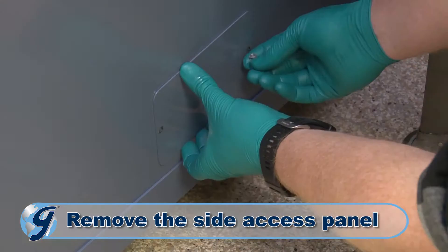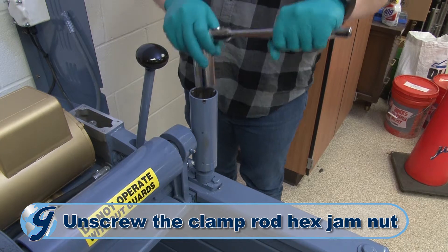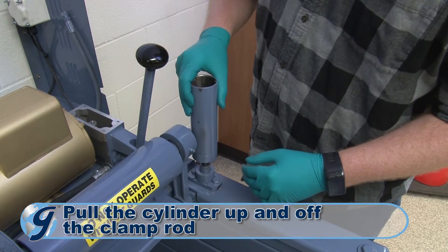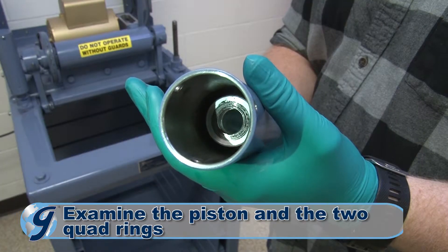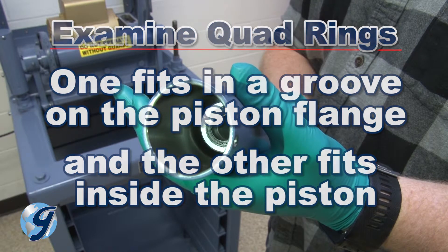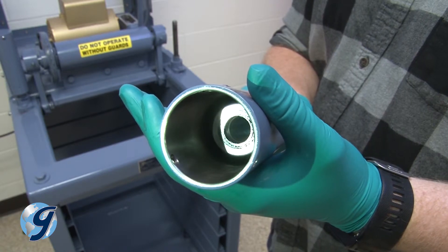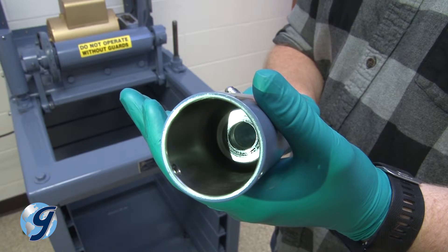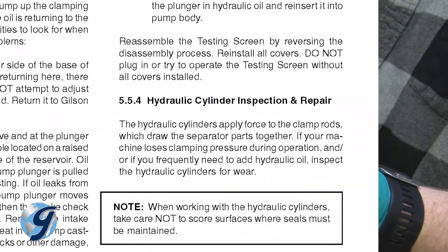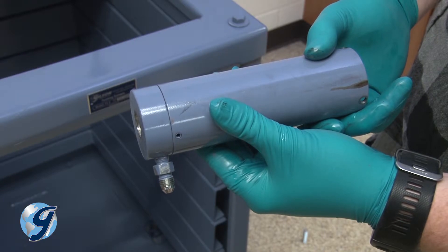Next, remove the side access panel near the machine's base. Grasp the lower section of the clamp rod with vise grips. Now, unscrew the clamp rod hex jam nut within the cylinder, then pull the rest of the cylinder up and off the clamp rod. Examine the piston and the two quad rings — one fits in a groove on the piston flange and the other fits inside the piston. Replace quad rings if you find hydraulic oil above the flange on the piston. Very rarely will the cylinder o-ring need to be replaced. If it is deemed necessary to replace the quad rings or the o-ring, follow the hydraulic cylinder inspection and repair instructions in your operating manual. For this demonstration, we are not replacing the quad rings or o-ring, nor are we removing the pistons from the cylinder.